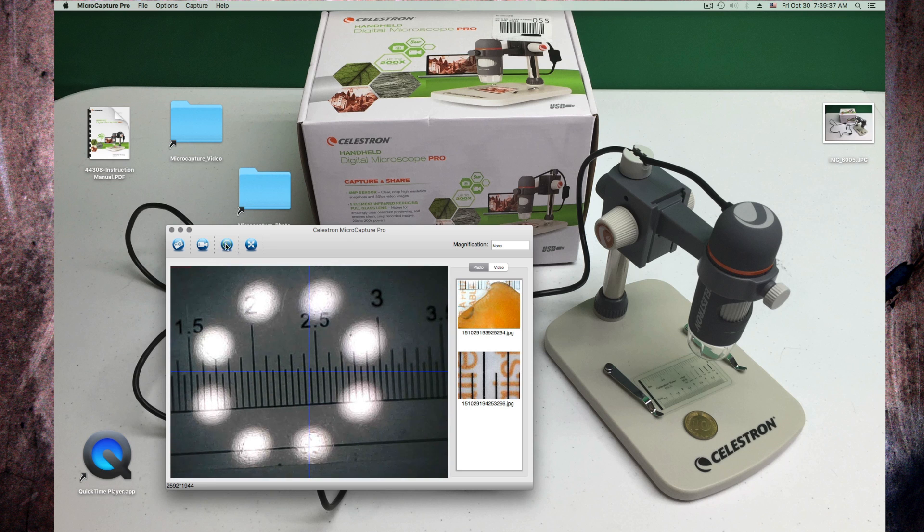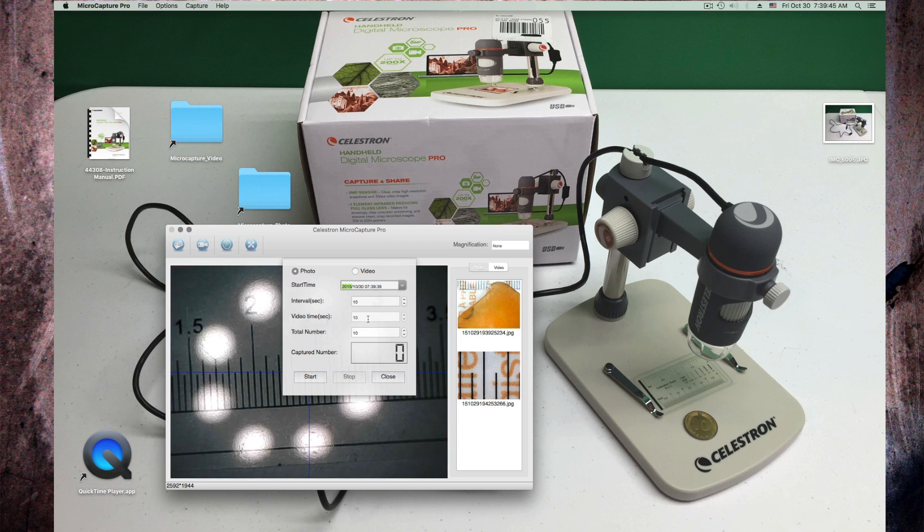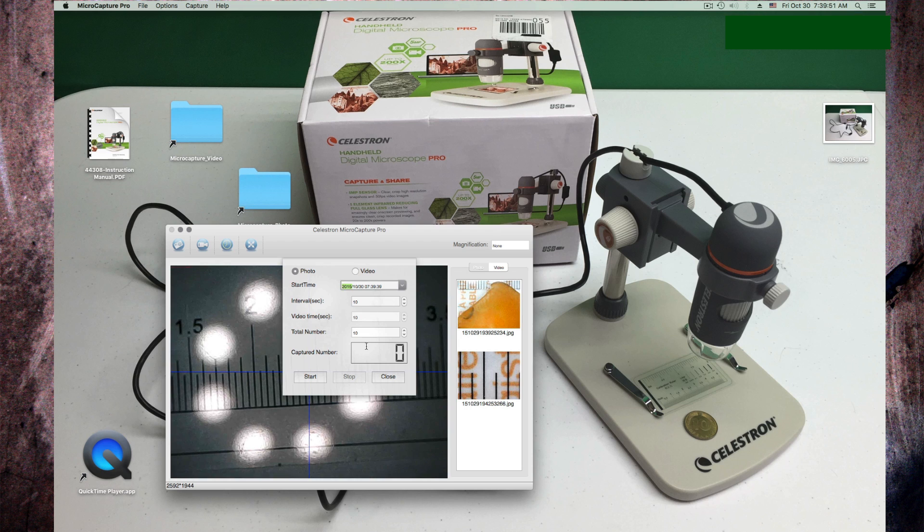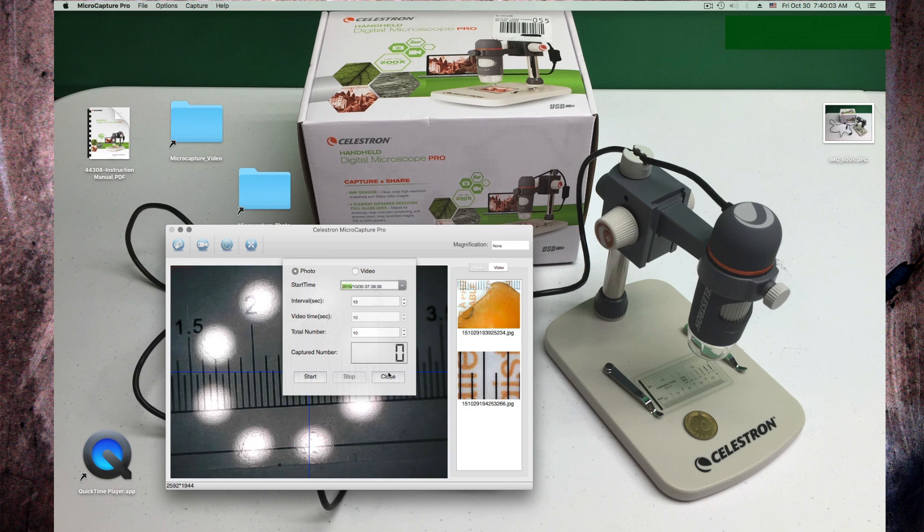I have a timer button in here where I can set when this thing starts to take pictures and what interval, video, what interval, how many, and here it shows how many it captures. I can do this with video or with photo. Close again.